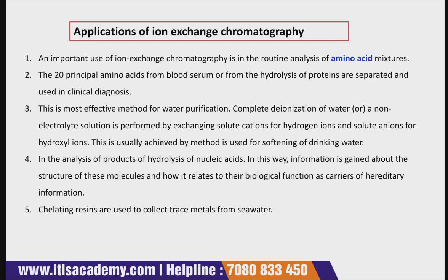The 20 principal amino acids from blood serum or from the hydrolysis of proteins are separated, and this has use in clinical diagnosis.